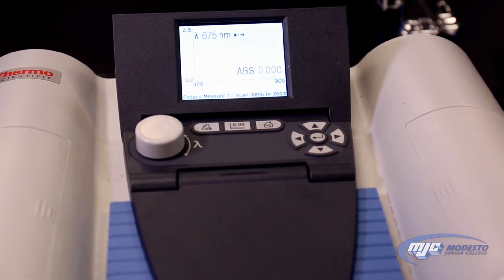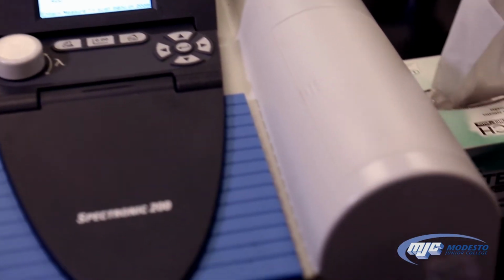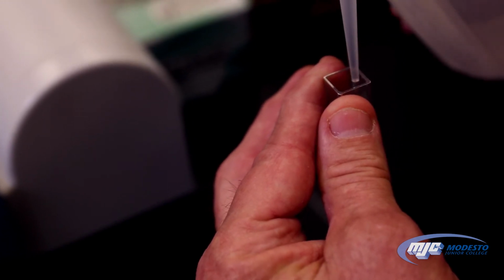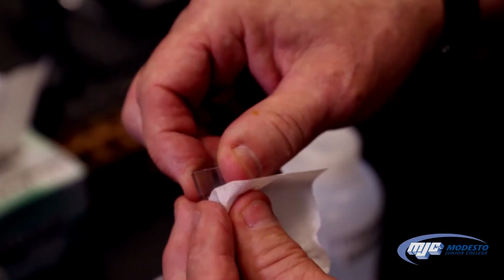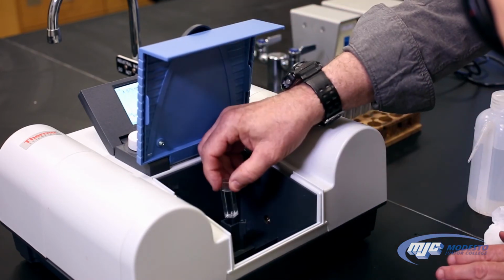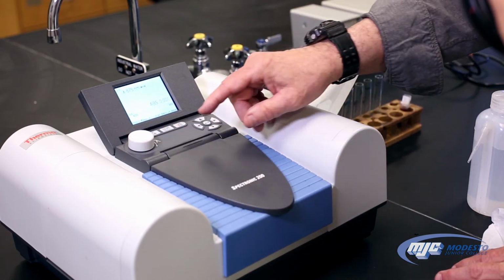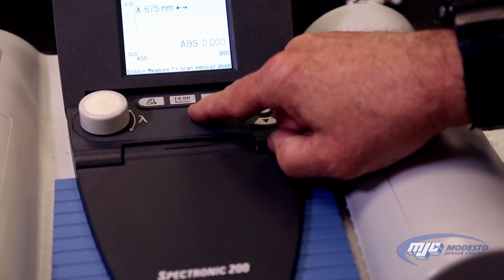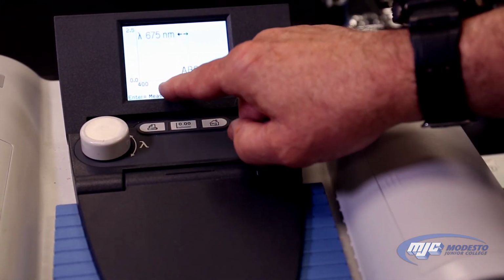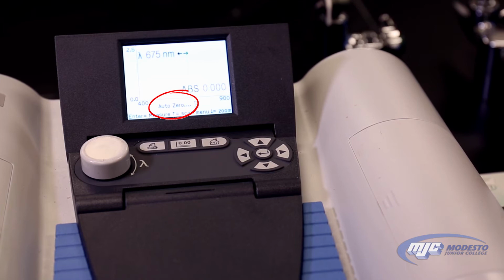Now, before we can do anything, guys, we have to zero out the spectrometer. So what we do is we take an empty cuvette, some deionized water, fill the cuvette to that line, right about there. We always wipe off the cuvettes with a Chem wipe. Pop the cuvette into the spectrometer right there. Close the door. And there's a button right up here that says 0.00. That's a 0 button. Press it. And see where it says auto 0 right there? When that goes away, it's zeroed. And we're pretty much finished zeroing it for the experiment.